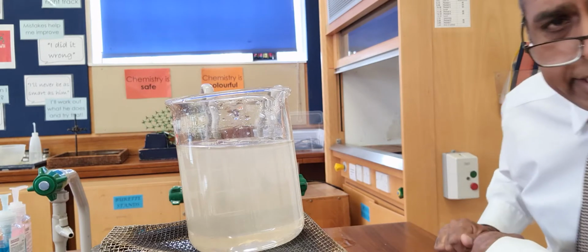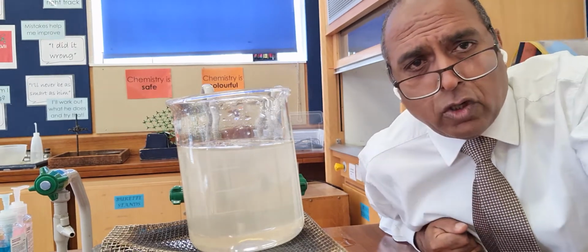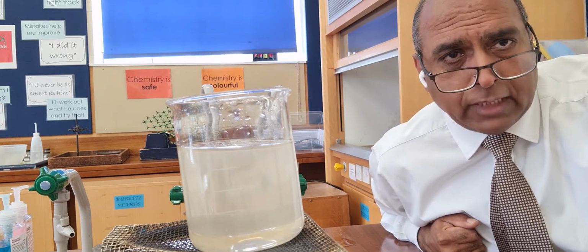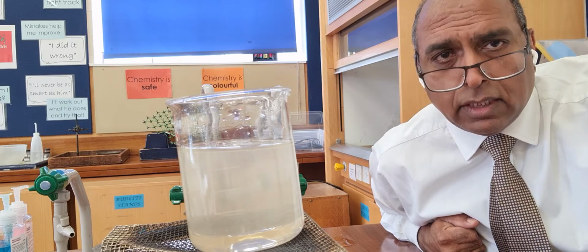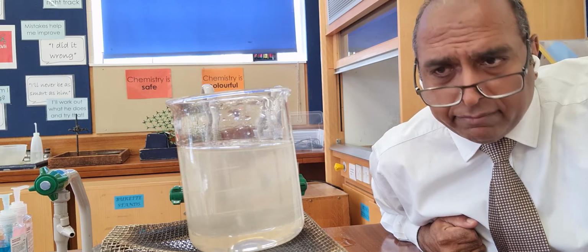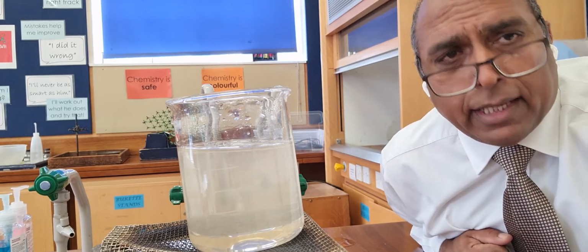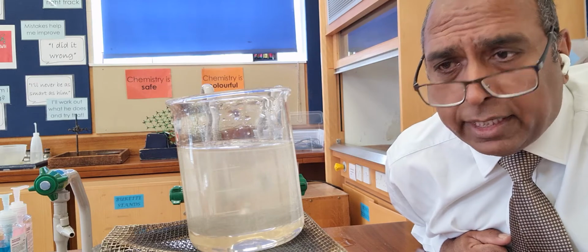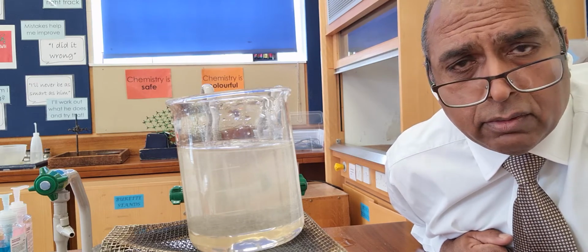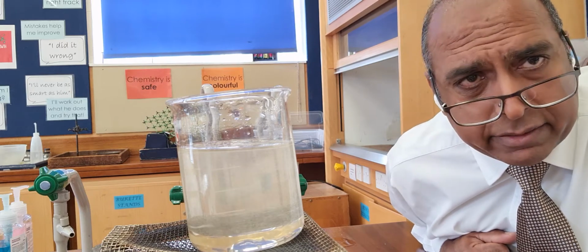Well, what did I get up to? 20. 20 spoonfuls of sugar. Do they dissolve? Well, now I leave it. There's some bubbling going on there. That bubbling is boiling. So the sugar solution is starting to boil. Okay, so that's about the hottest I can get it.